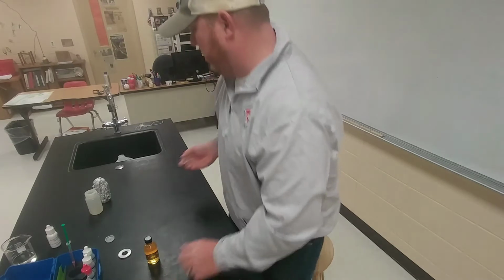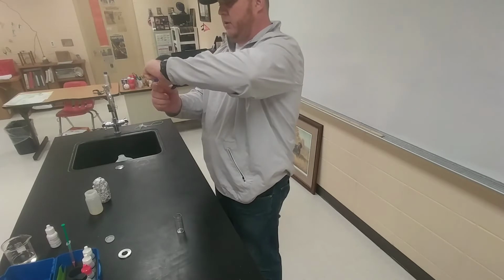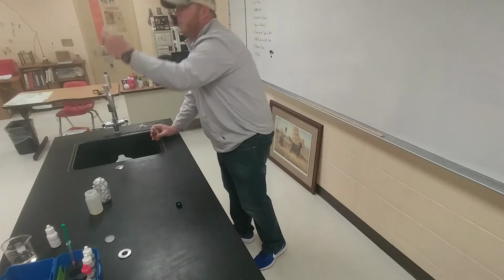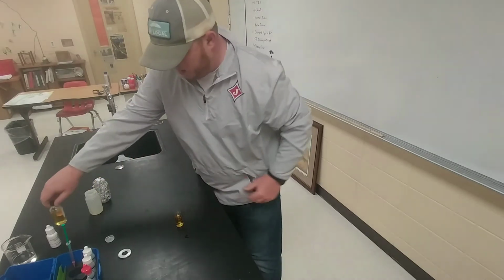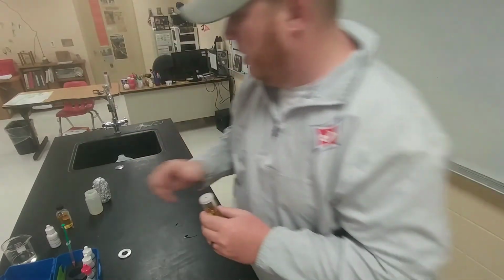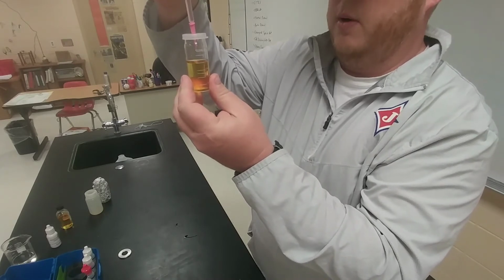So the first thing I need to do is, let me get this stool out of the way, fill this titrating vial up to the 20 milliliter line. Okay. This sample will keep for a minute just in case something goes wrong. And I have to titrate this solution until it's a pale yellow. So right now it's a kind of golden color. It's not as golden, I don't think, as the one previously. But I'll put a few drops of this in here and try to turn it some sort of pale yellow color.